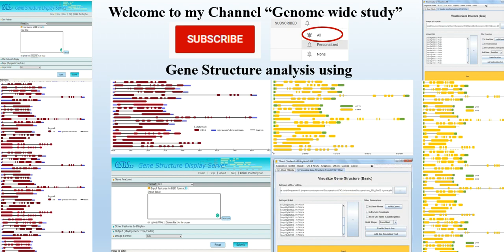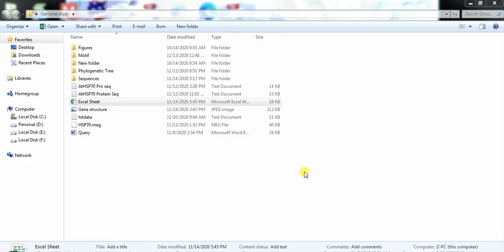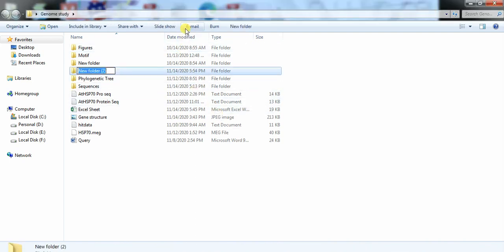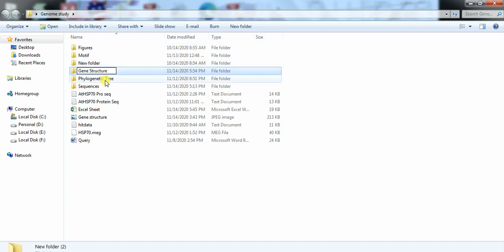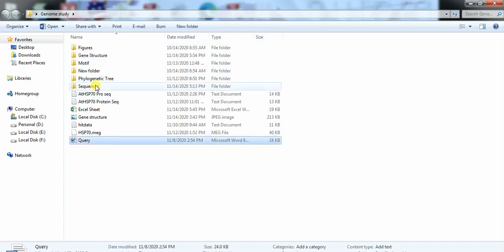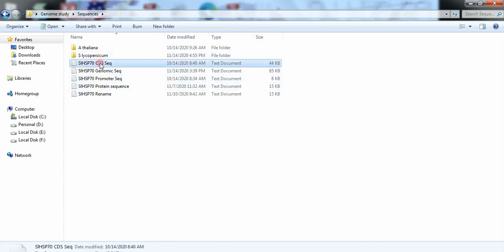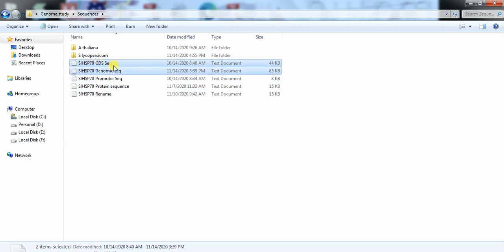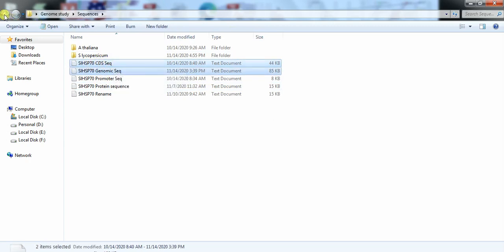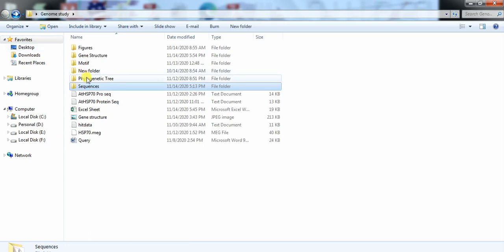So let's start. First open the folder that have files related to this project. Make a subfolder named Gene Structure. Open the sequence folder, copy these two files CDS and genomics, and paste it into that folder.